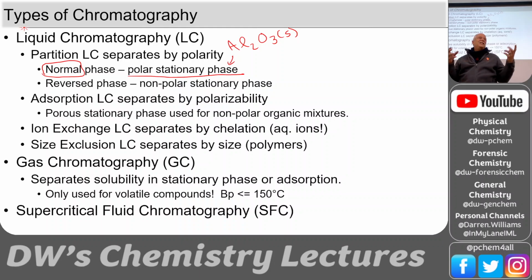So benzene's a sticky molecule. It has a huge electron cloud. So if we make a polymer with benzene, then we have a sticky polymer, and when molecules interact with that polymer, they stick to it. Organic molecules stick to it. So that's kind of what we're talking about, a non-polar stationary phase. We can make a polymer with lots of benzene rings on it, and then that's a sticky polymer.